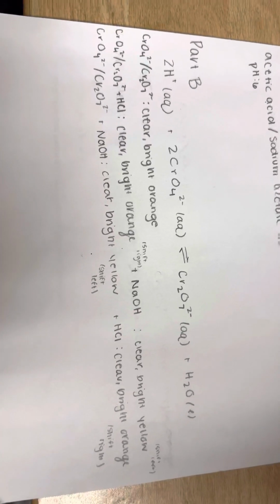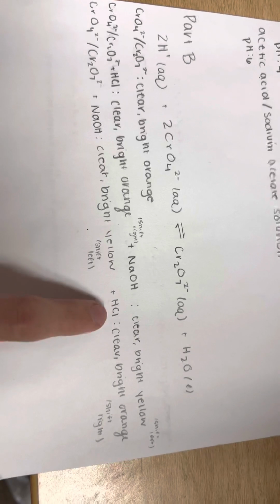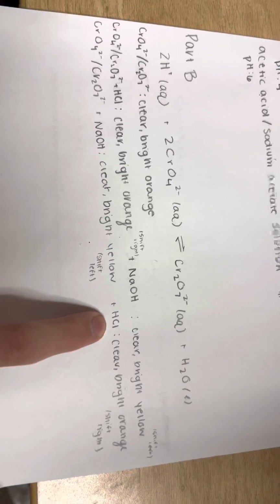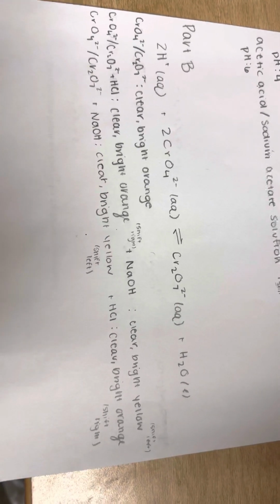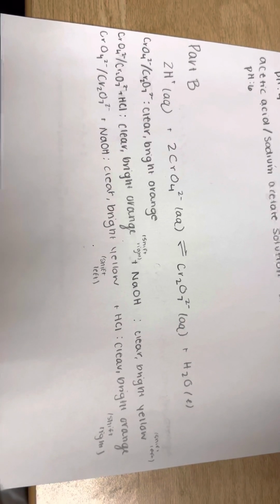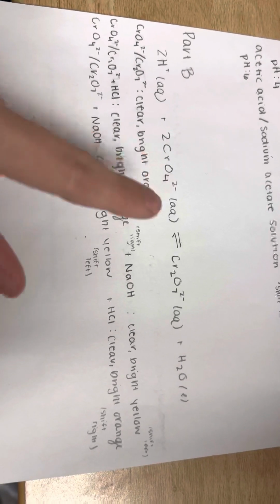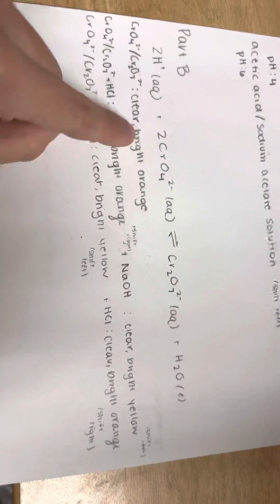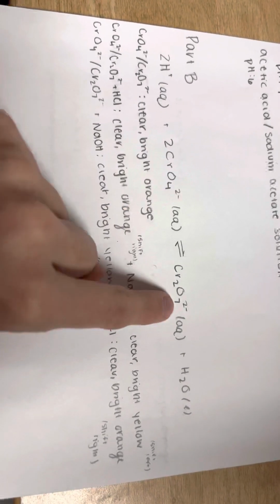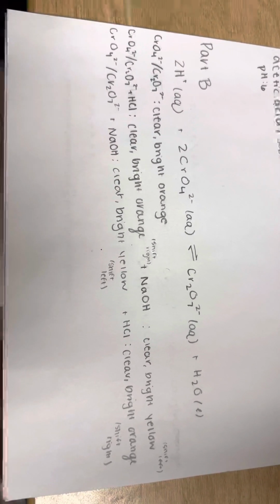However, this is an already basic solution, when the HCl, which is an acid, was added, a more clear bright orange color was created, which dictates a shift to the right because it is decreasing the CrO4 2- and increasing the Cr2O7 2-, which is calling for that orange color.